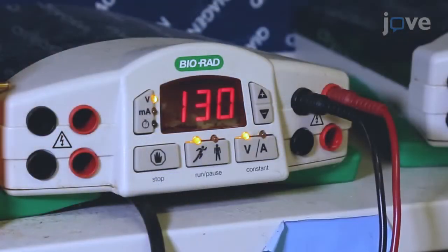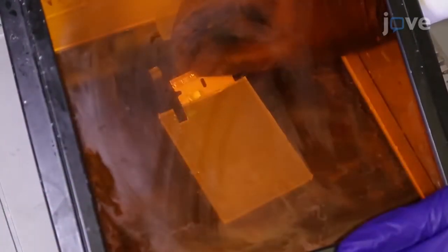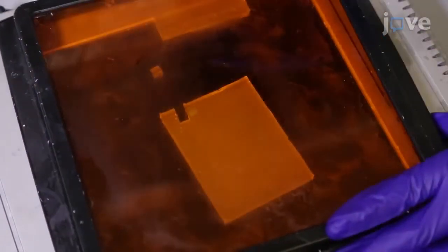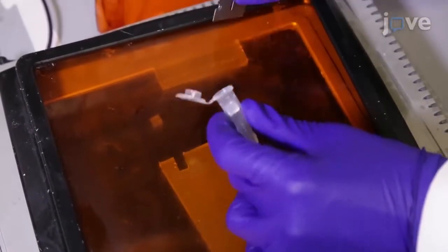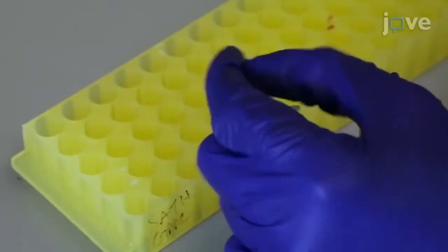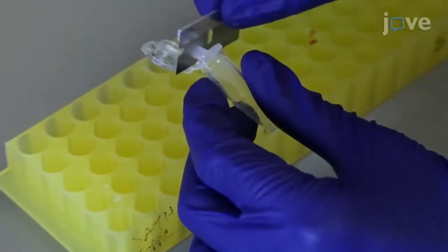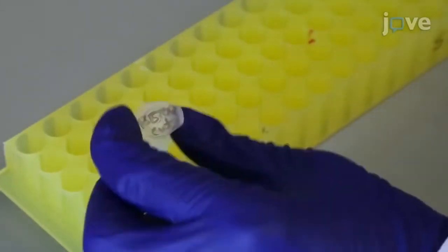Run the digestion products on a 1.5% low melting agarose gel. Cut out the digested vector backbone band that corresponds to a fragment approximately 9 kilobases in size. Transfer this gel slice to a 1.5 milliliter microcentrifuge tube.